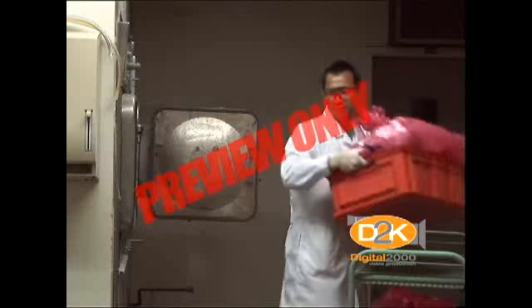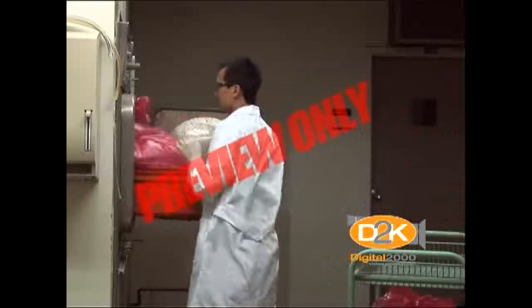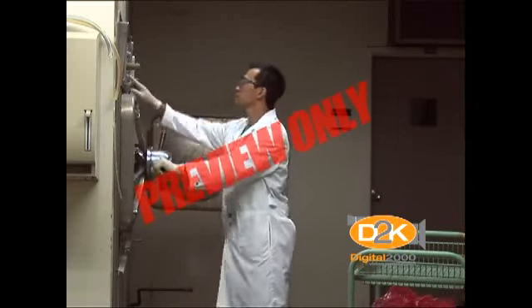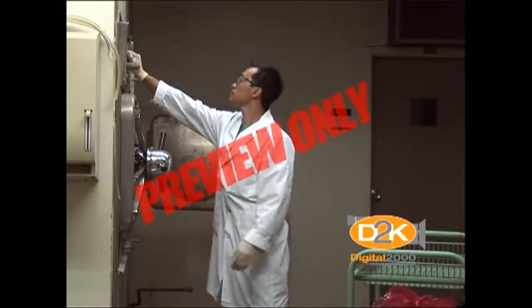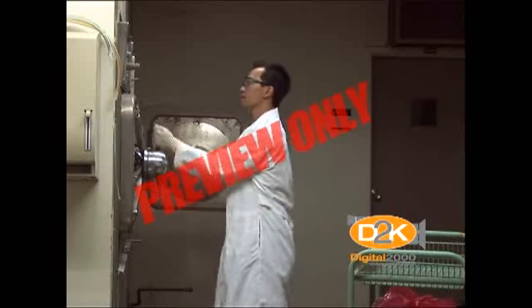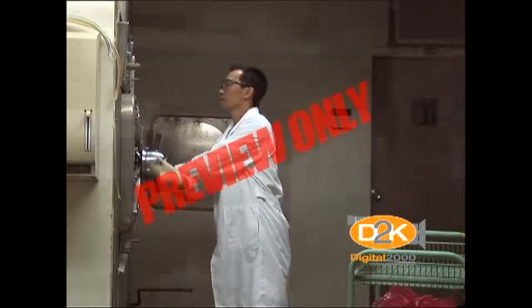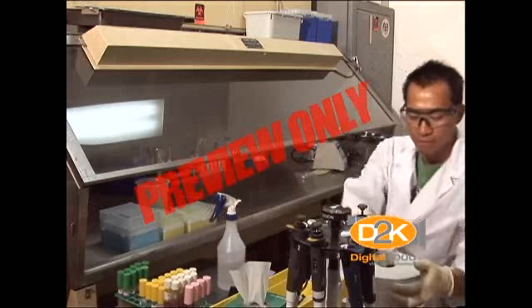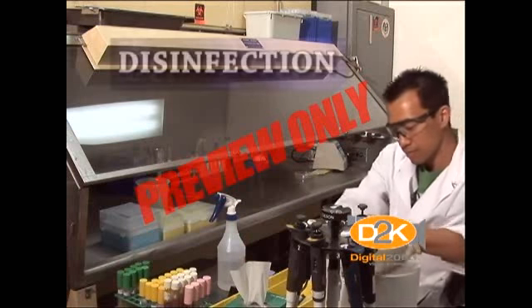Unless specifically tested, cell cultures may contain infectious agents. You must observe universal precautions and consider all unknown cultures or specimens to be infectious, and you must treat these materials as potentially hazardous. Biological safety depends on proper cleanup and removal of potentially harmful agents.